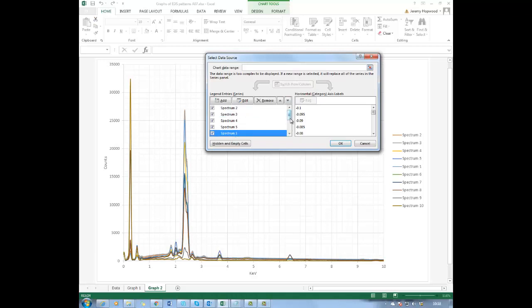So number 1 is down there at the moment, and we keep clicking it a few times. It'll take a little bit of time. Wait, and number 1 is now at the bottom. You then need to do that for number 2. So click downwards. I just keep clicking it and then stop and wait. So I'm waiting. And now I'll have a look. I don't know why my computer's so slow this morning. There we go, go down to bottom 1.